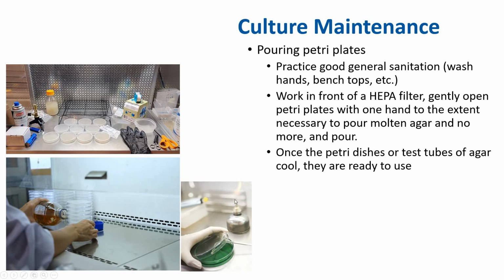And you can work under a Bunsen burner or an alcohol lamp. It works just as well. So place your hand between the dish and your body, not between the HEPA filter and the dish. So remember, we just established that.